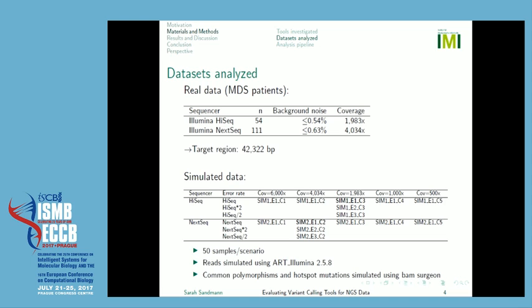Yeah, and that should actually match our real data. And then we also started playing around a little. So we increased and decreased coverage, we increased and decreased the error rate, just to investigate what is the effect on our variant calling process.